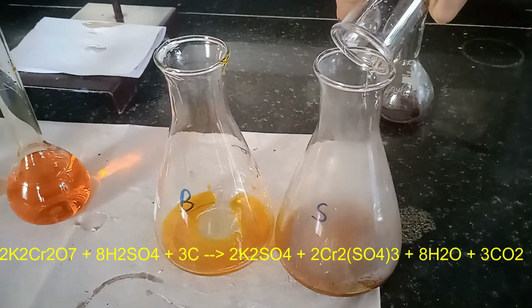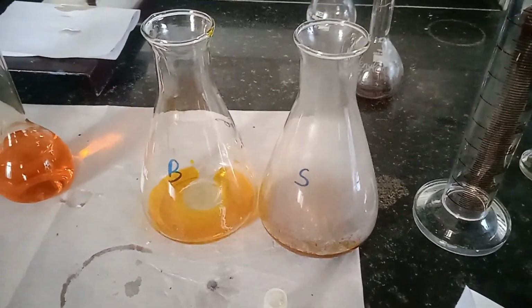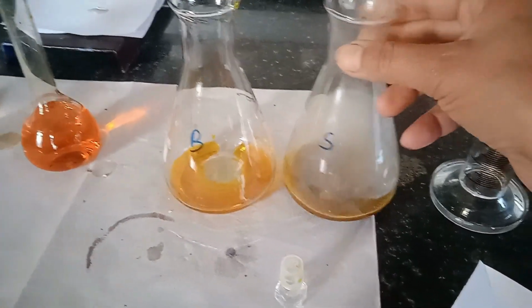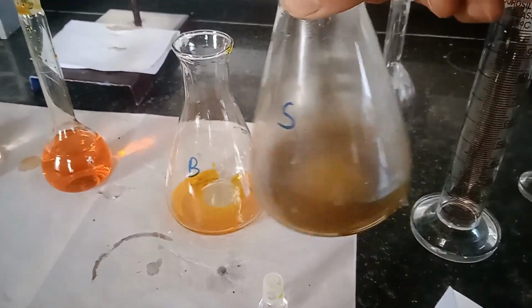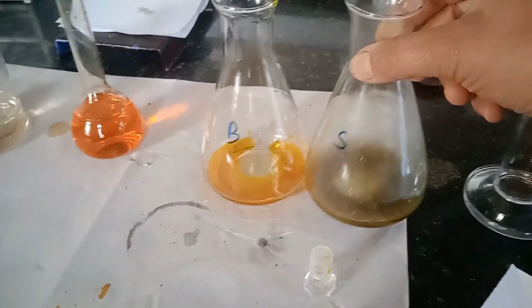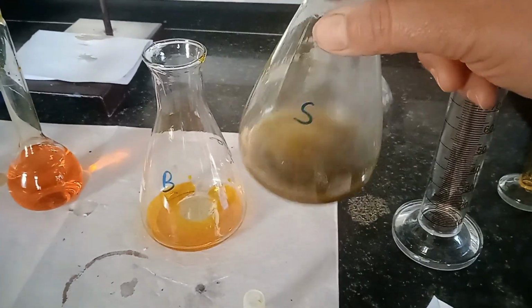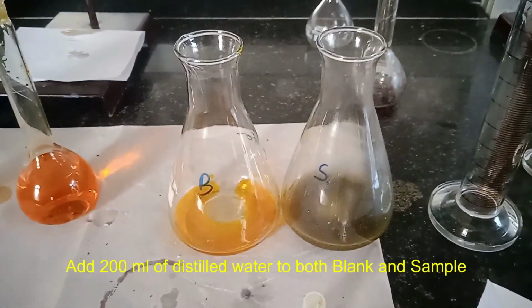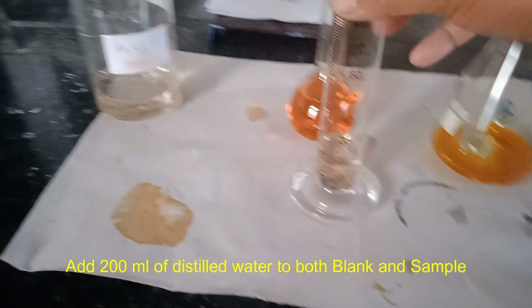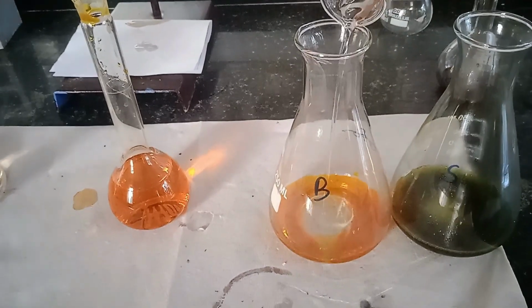This reaction is going on, K2Cr2O7 in the presence of sulfuric acid. It reacts with the organic carbon and carbon dioxide is produced in this reaction, whereas K2Cr2O7 gets reduced. Here you can see the color change. This greenish color is shown by the change in oxidation state of chromium. This is chromium 3.